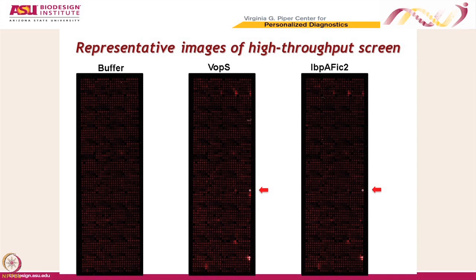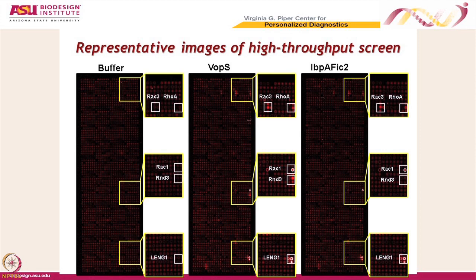When you're a researcher in the lab, when you're a graduate student in the lab, and you see only a few spots light up, that's what really gets you excited, because if everybody lit up, then you know there was a lot of background and it probably didn't mean anything. But if only a few selective ones light up, that's a sign that you really found something. So this is what those spots look like, and of course these are the identities of those spots. You can see that they have very clean signals, right? And of course you don't see those signals over here on the control.